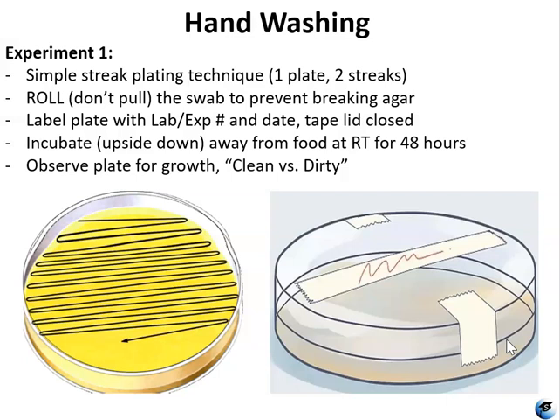You will incubate it at room temperature, just at regular temperature. You don't have to try to figure out any kind of 37 degrees or 98 degrees, nothing like that. You do want to store it upside down, even while it's incubating. So you're going to flip this over and incubate it upside down at room temperature, and that has to happen for 48 hours. So this is 2 days of incubation.